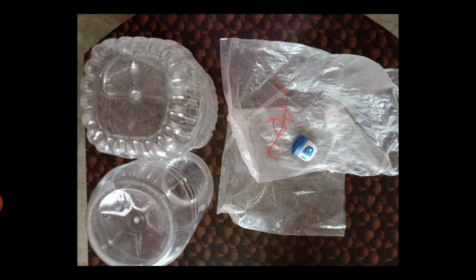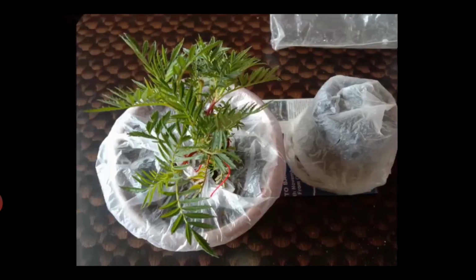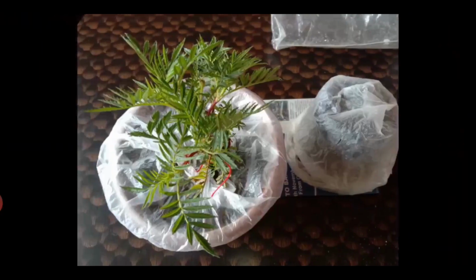Now in order to do this experiment, we need to follow some steps, some procedure. Now the first step I'm going to show you. We need to take a potted plant and cover the pot along with the soil with a plastic bag.